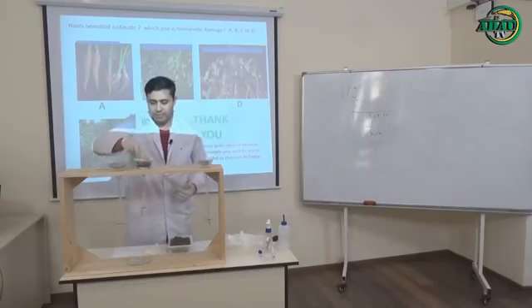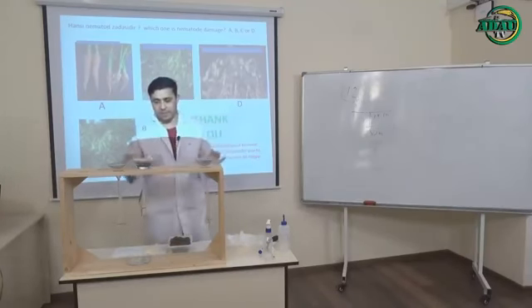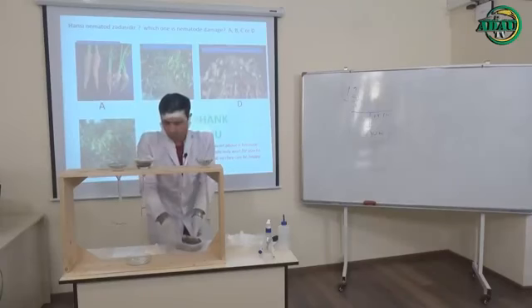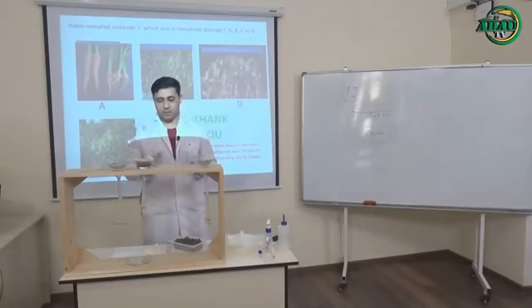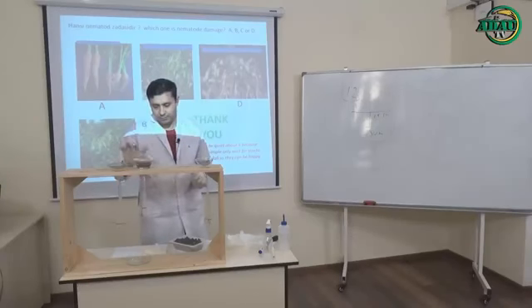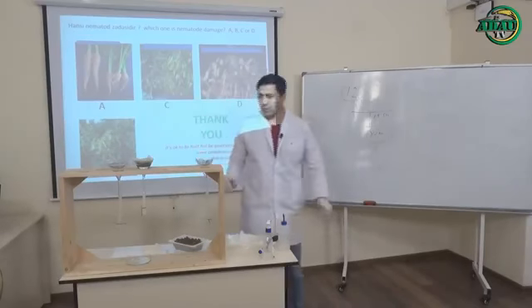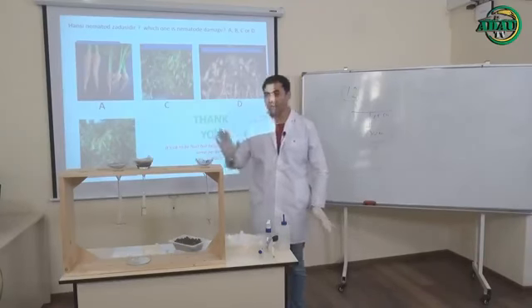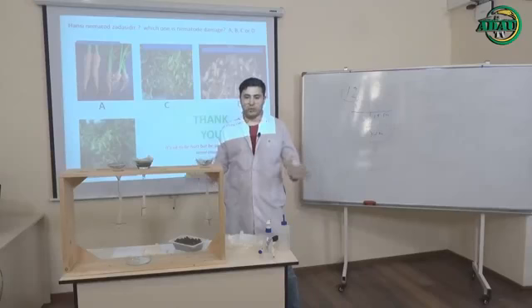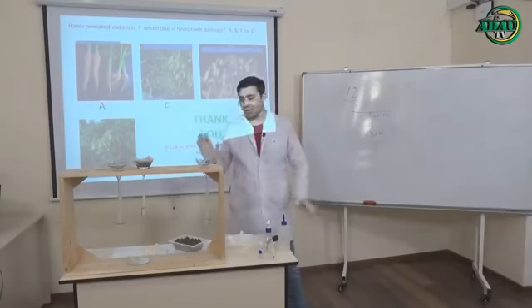Okay. You can add enough soil. There is no rule for how much soil, not the size of the soil. Just add enough soil. After that, you have to wait. As I said to you, more than 12 hours. You can do this in your laboratory, in your research center. After that, you have to wait 12 hours.